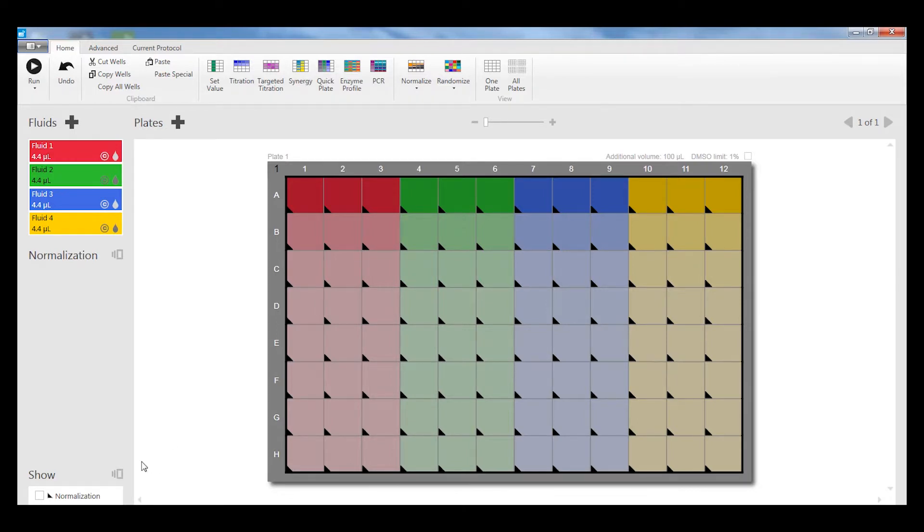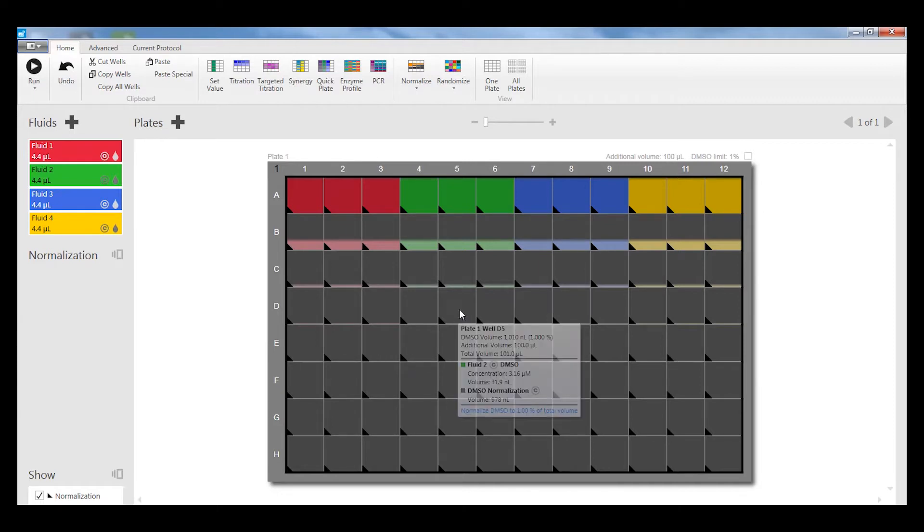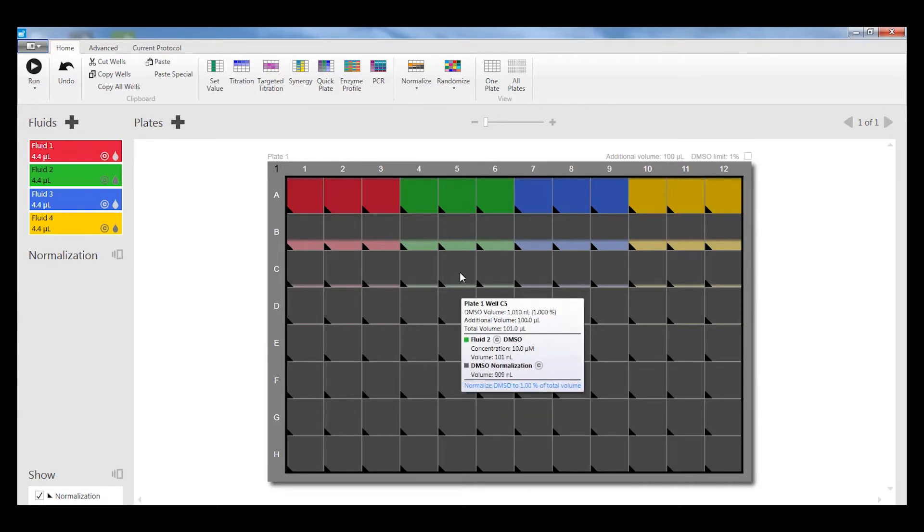If I click on Show Normalization, it shows that most of the fluid dispensed into each well is DMSO, shown in the gray. But I don't have to show that in my display. I can unclick that.